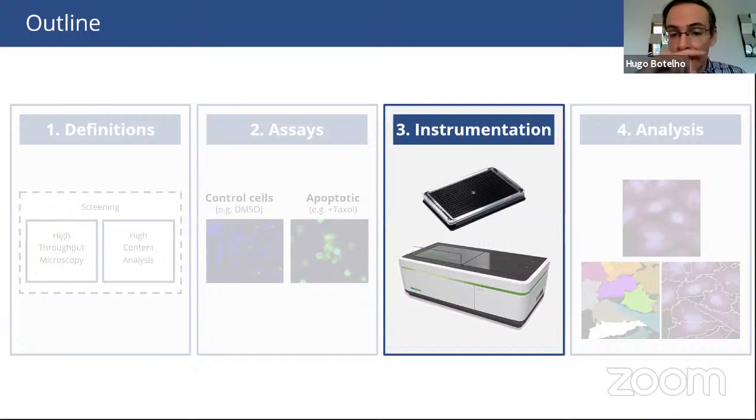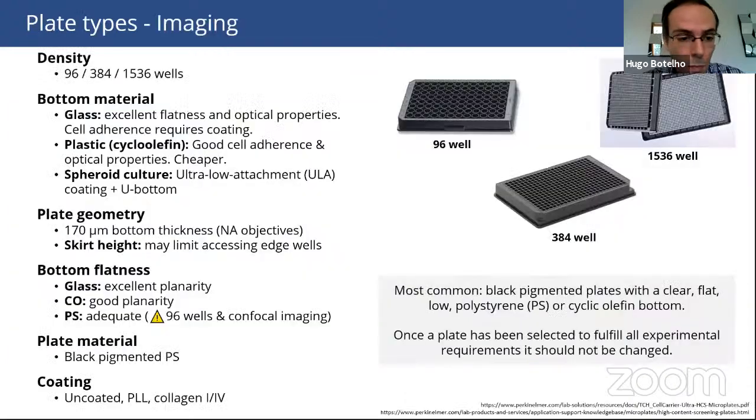So far, I've talked about assays and biology, but at this point, I should better talk about the instrumentation and which considerations you need to have when performing these assays in real life.